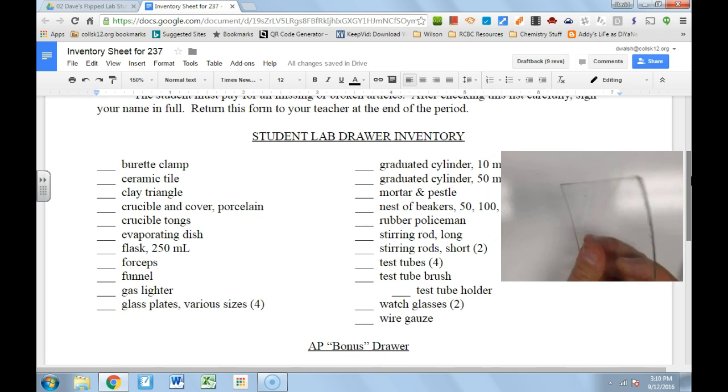And then we have these glass plates. These are in your drawer for utilitarian reasons — maybe you want to get close to something to protect your eyes even more than goggles will. There are a bunch of these in different sizes.